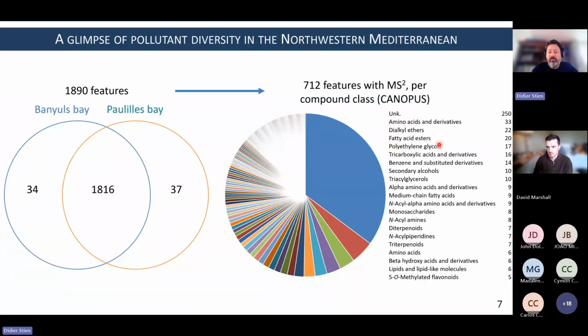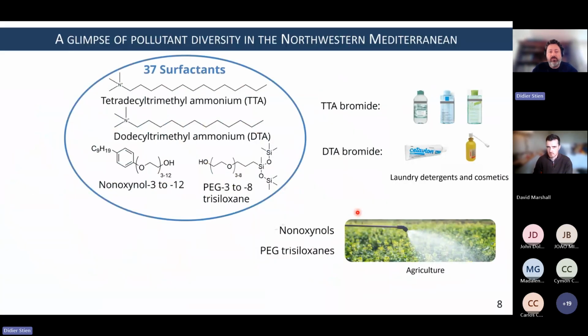But first of all, 1/3 are not annotated at all, and for the rest, I can tell you that it's actually not very good. And secondary alcohol, for example, is very vague. So after that, we really have to go into detail and annotate manually what are the major components of the mixture. So if you do that, it takes time. I'm going to show you what we have on 50 compounds here.